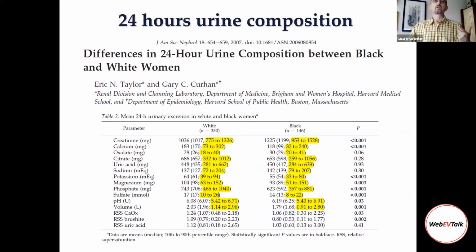So the following question is, when we want to compare different samples, what is the ionic profile of urine? In this study, which was carried out on the 24-hour collection, you can appreciate the interval range of volume from 1 up to nearly 3 liters. pH can span up to nearly 2 units of pH. Sodium chloride is of our interest for the polymerization of Tamm. And it would be interesting to know, when we have to compare samples at both ends of the interval, how THP behaves, how much is polymerized, and so forth.